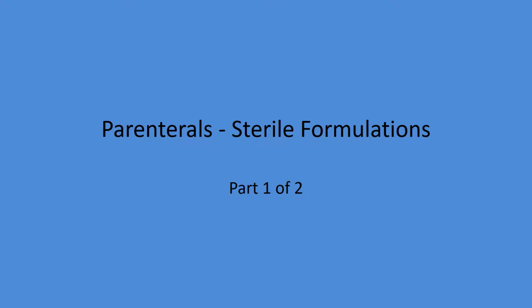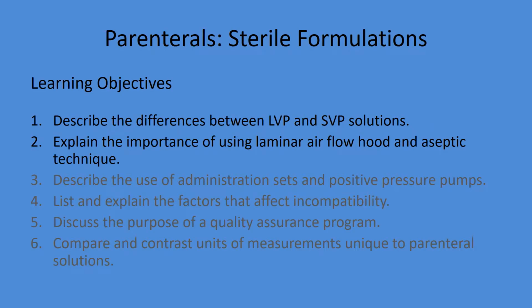Alright, today's lesson, parenterals. So we're talking about sterile formulations. We'll talk about large volume parenterals, small volume parenterals, laminar flow hood, and then we'll get into aseptic technique. And then for next time, we'll cover the remaining learning objectives.